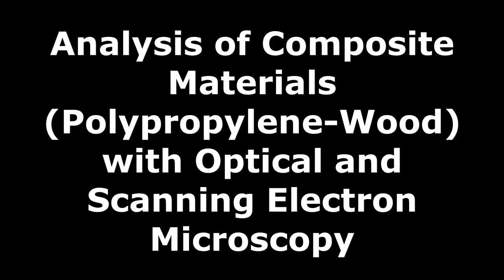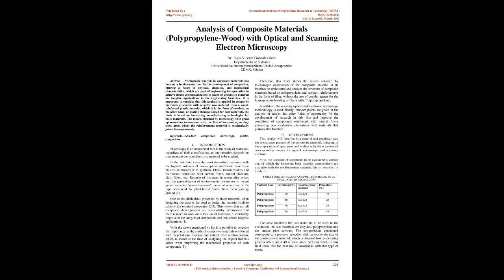Analysis of composite materials, polypropylene-wood, with optical and scanning electron microscopy. Abstract: Microscopic analysis in composite materials has become a fundamental tool for the development of composites, offering a range of physical, chemical, and mechanical characteristics, which are part of engineering interpretation to achieve direct conceptualization in favor of composite material for tangible applications in the engineering branches.